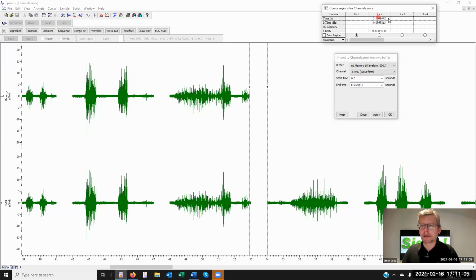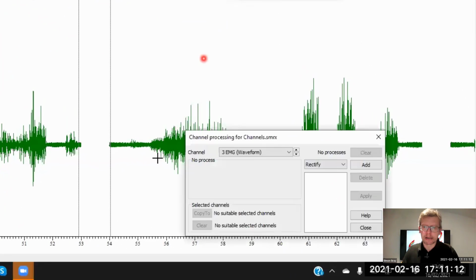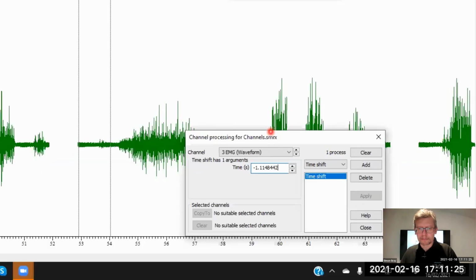If I then take this value, time difference, and I channel process the original channel 3, add, time shift, and add. It's got to be a negative time. I'm shifting to the left. There we go.